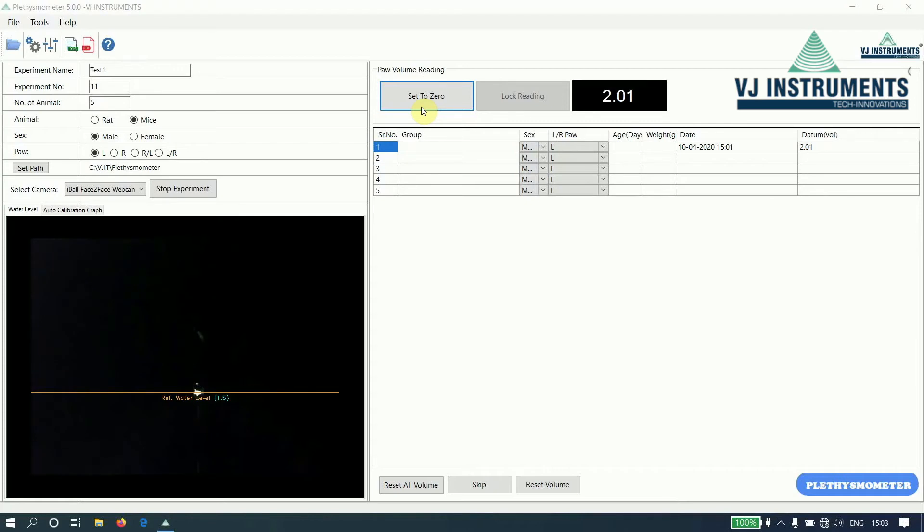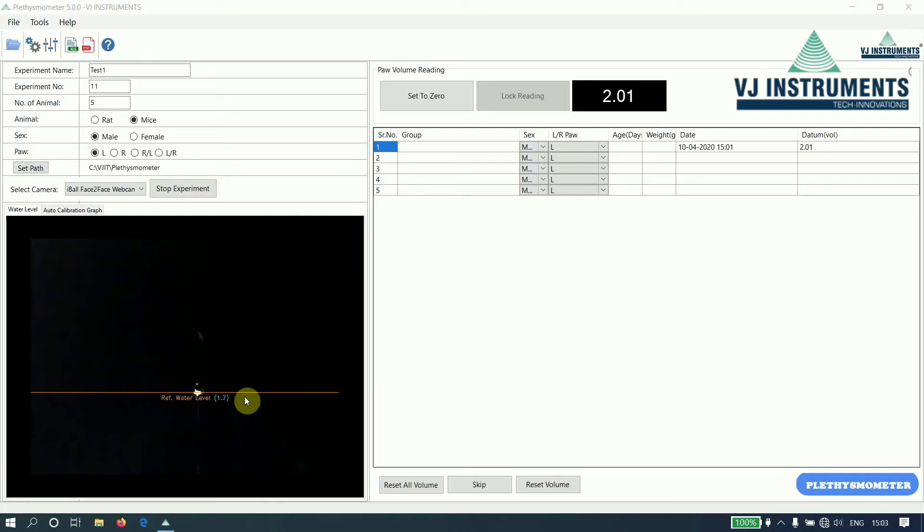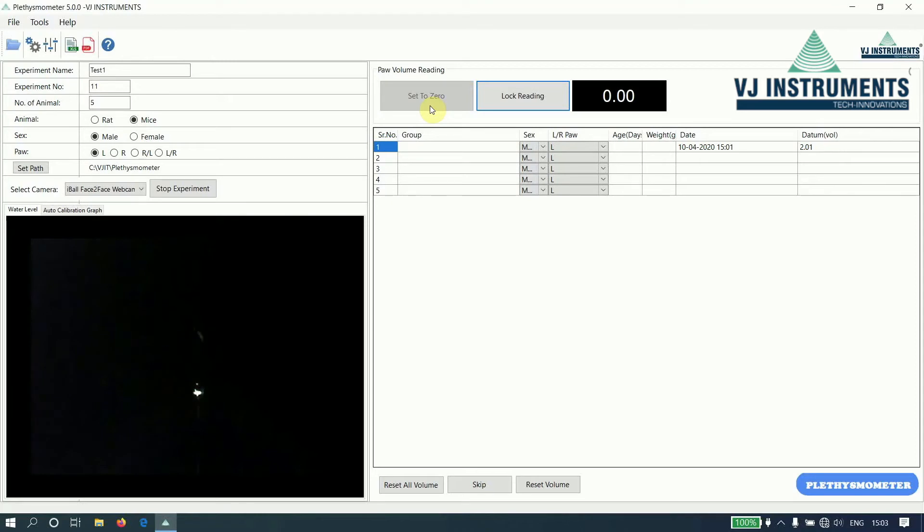Now remove the cubes inserted in the tube and check the reference water level. It is within plus or minus 5. Now again click on set to 0 button and insert the actual paw of the animal.